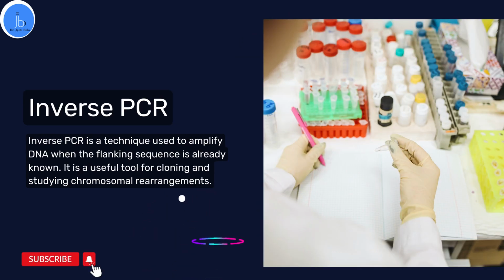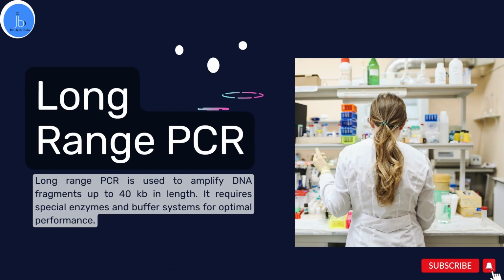Inverse PCR is a technique used to amplify DNA when the flanking sequence is already known. This kind of PCR is used for cloning and studying chromosomal rearrangement. And the next one is your long-range PCR. Long-range PCR is used to amplify fragments up to 40 kb in length, and it requires special enzymes and a buffer system for optimal performance and standardization.